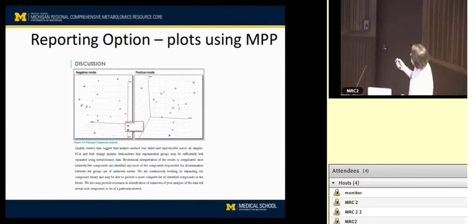So then, like I said, we will do all those steps, the feature finding, the recursion, trying to go back and remine the data to make sure that we have aligned the peaks and made them as representative as they can be to the best of our knowledge. And then if you give us groups, we will go ahead and do some statistics for you.